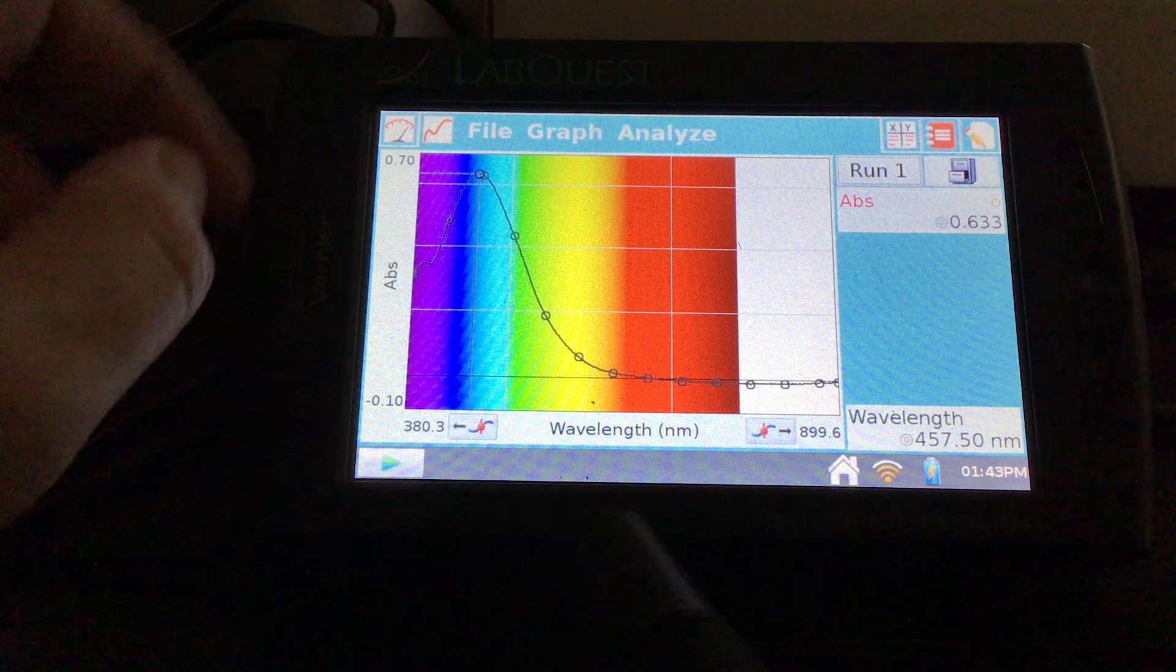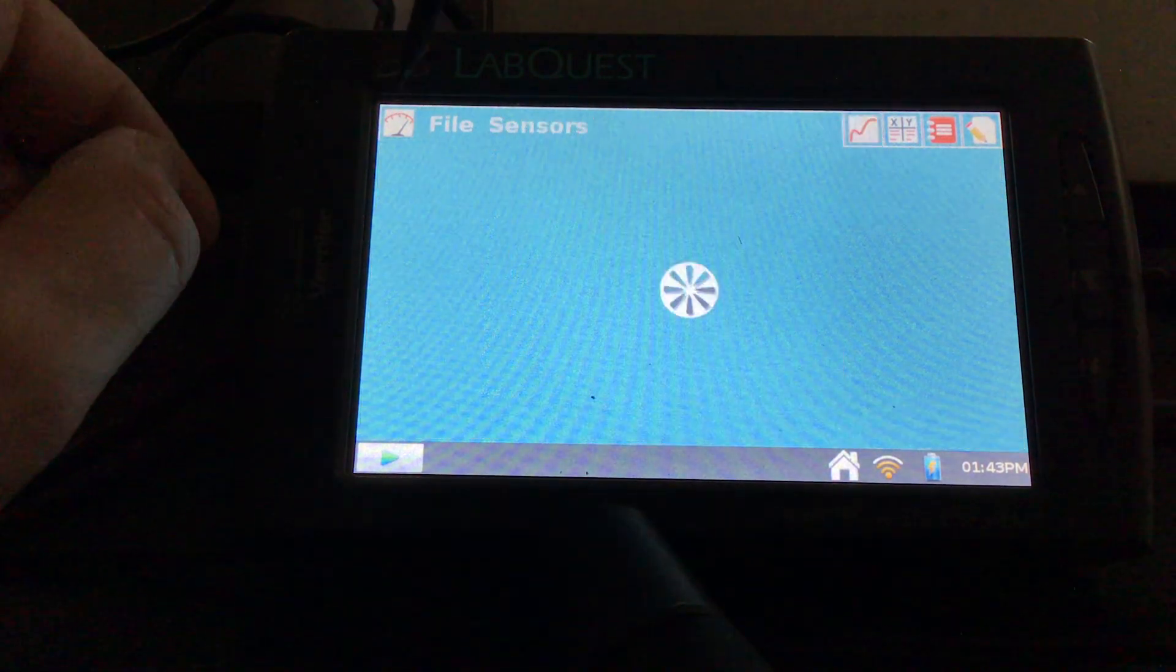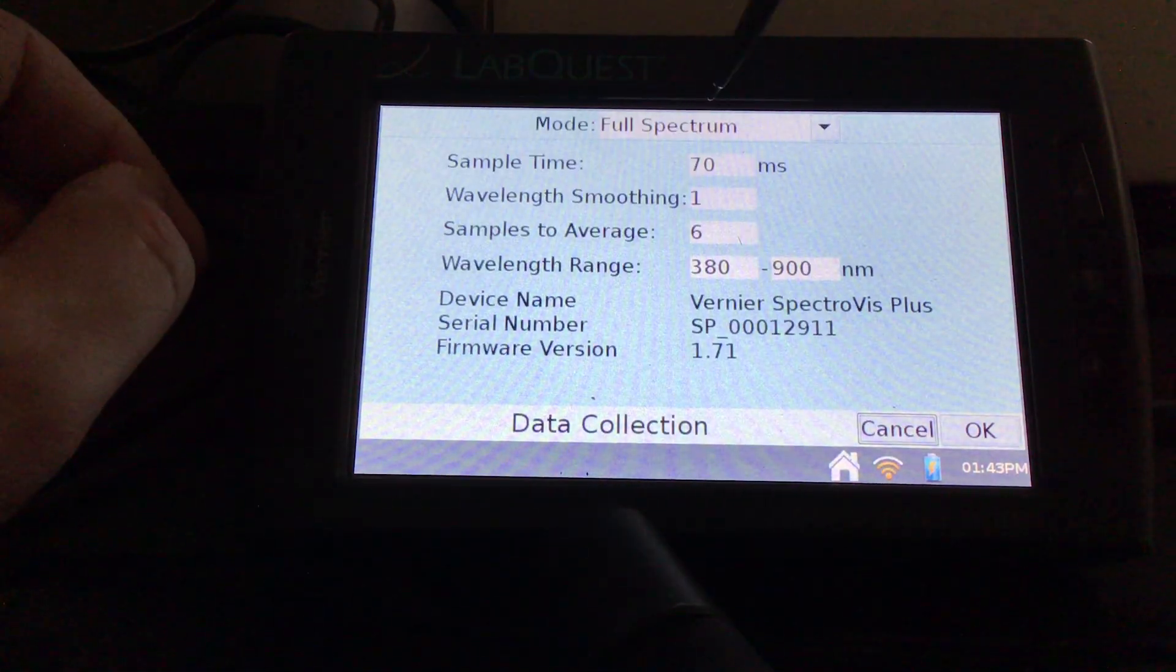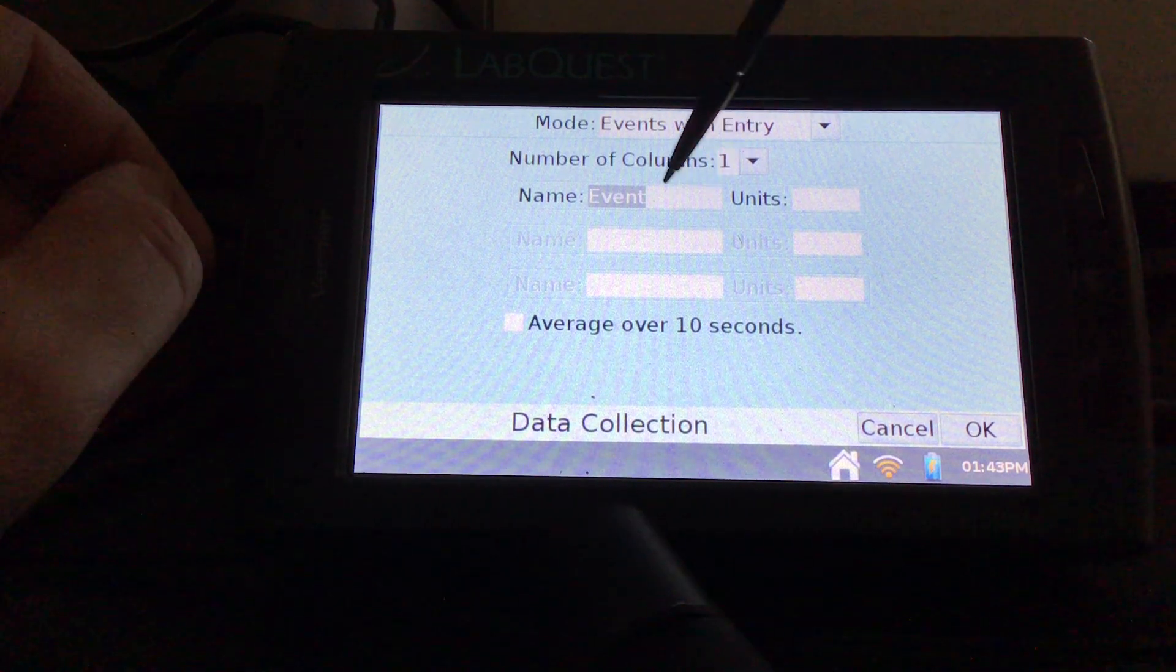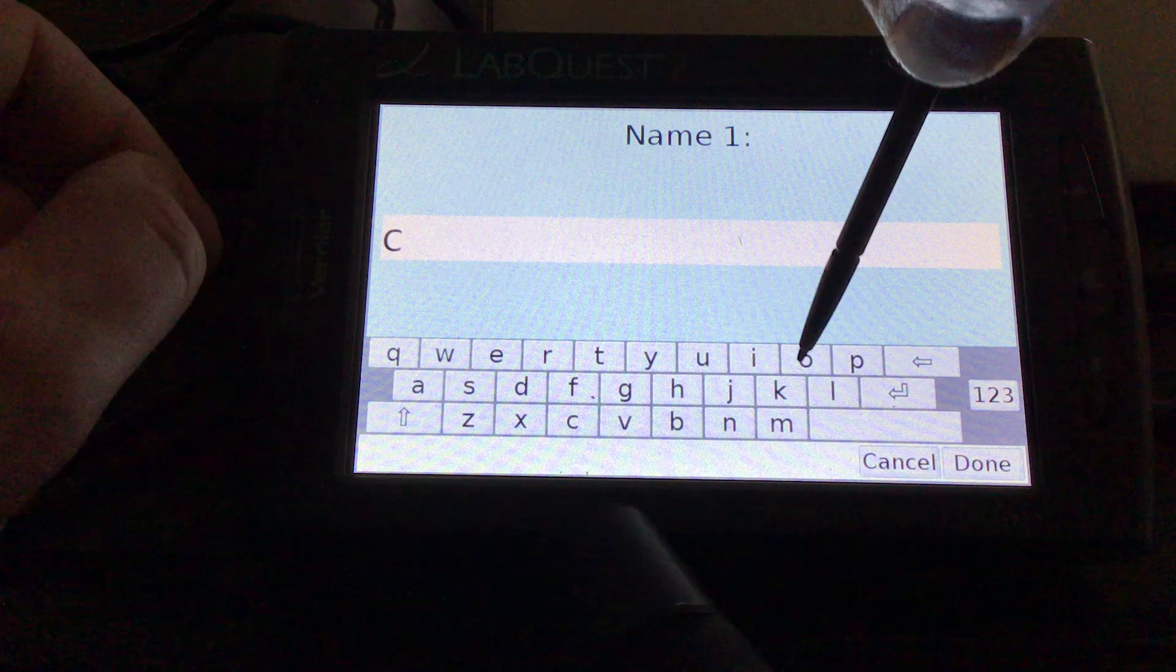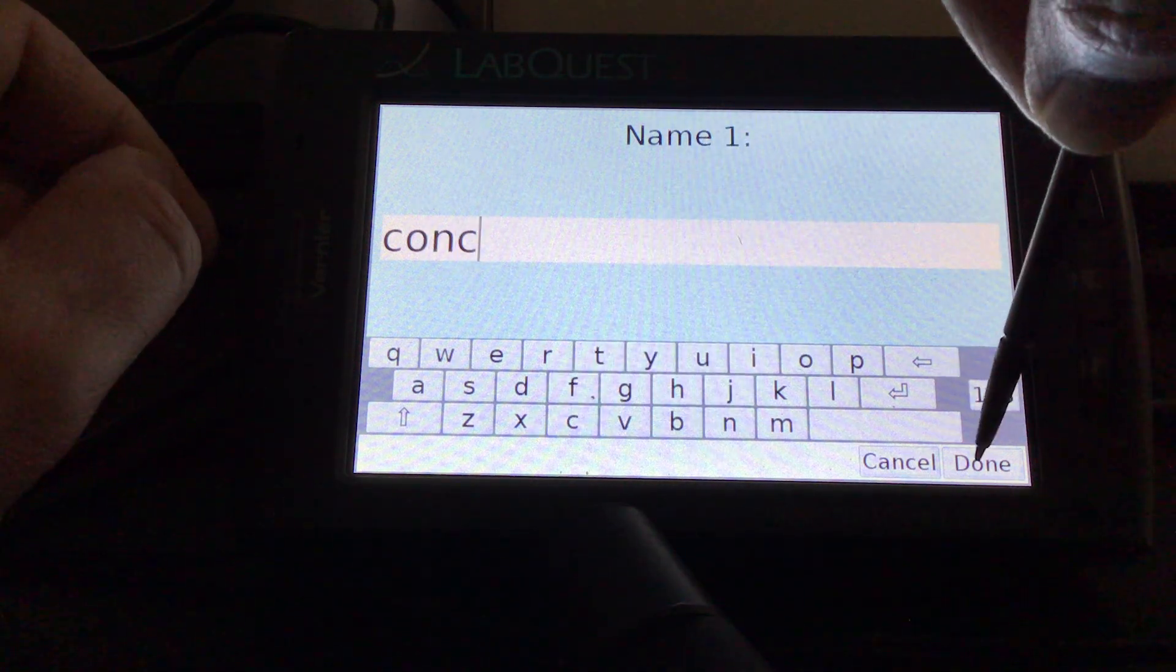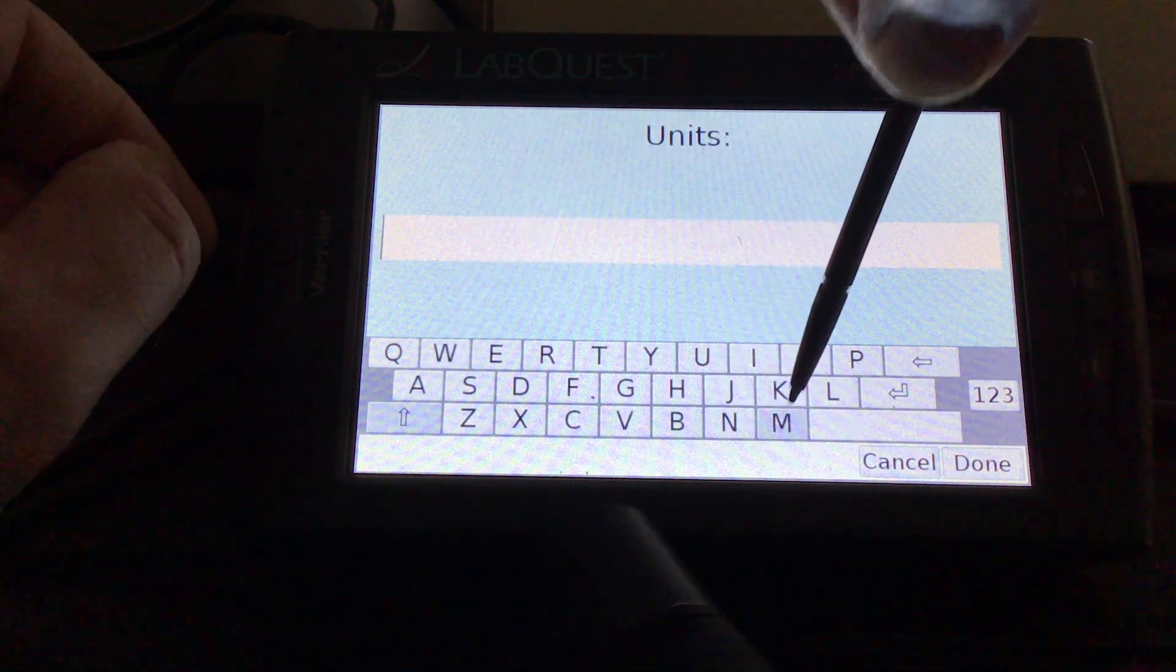So now I'm going to go and I'm going to change the mode. I'm going to go top left here. I'm going to change the mode to events with entry. And then we can label this maybe like concentration, CONC, something like that. And then with units, we can put capital M for molarity.